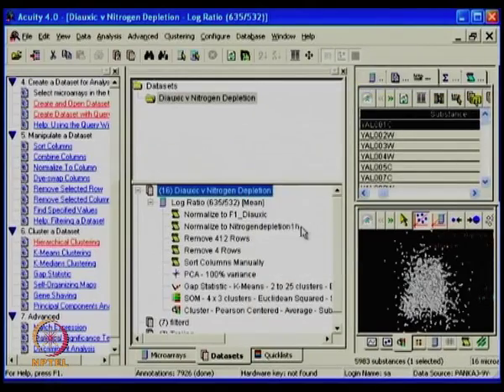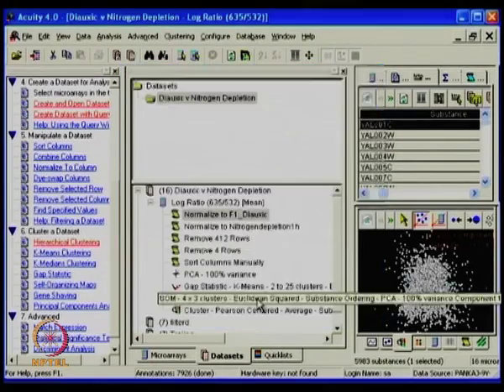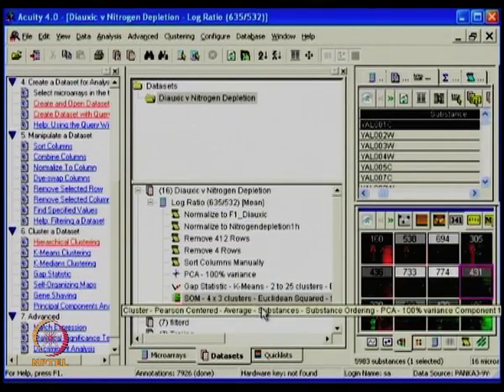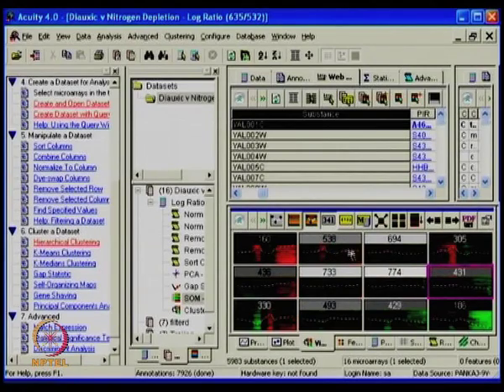So here I have normalized the data to F1 so I can see the script, what is happening. I can look at the one which I have performed at the level of different processing. When I look at SOM, which I have done at the level of 4x3 clusters, SOMs is something like non-hierarchical type, so they are individually being blocked. All different genes behave differently and based on the profile they are made into one group.